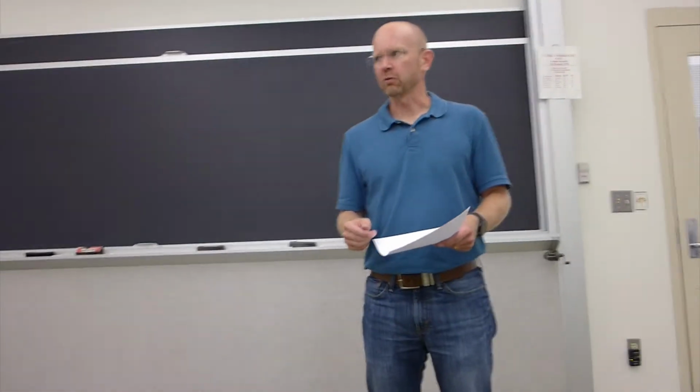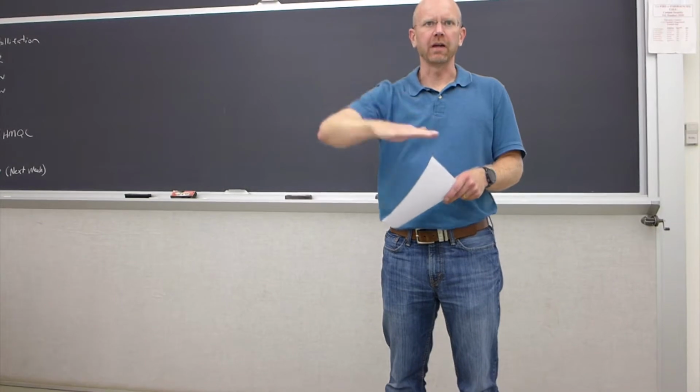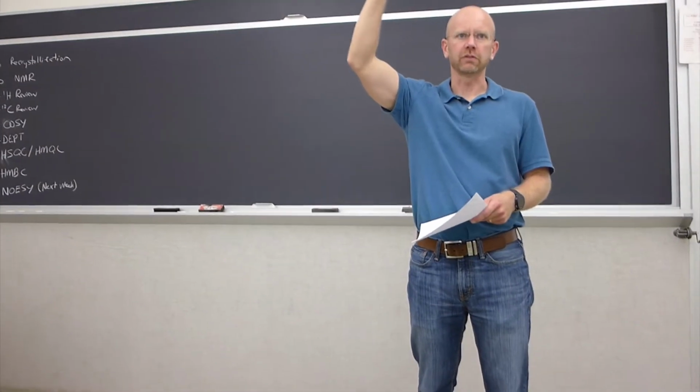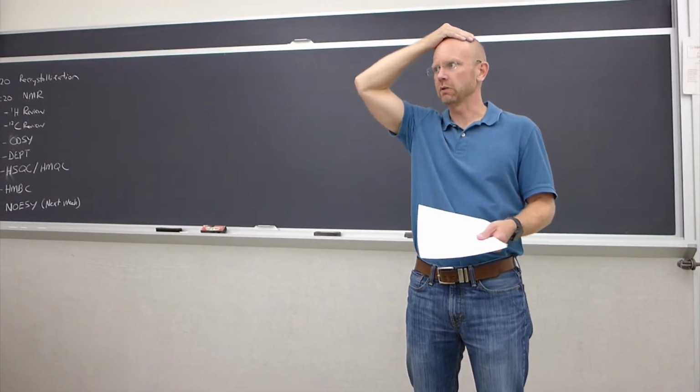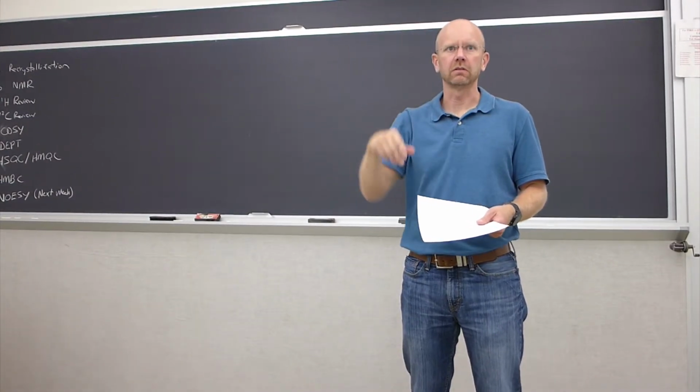So we're gonna talk about recrystallization, and let's do it from the very top down. Why is it that we do recrystallization? What's the point of a recrystallization? When would you consider doing it?